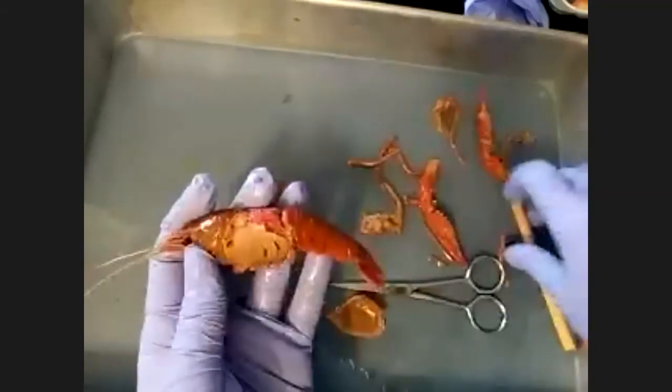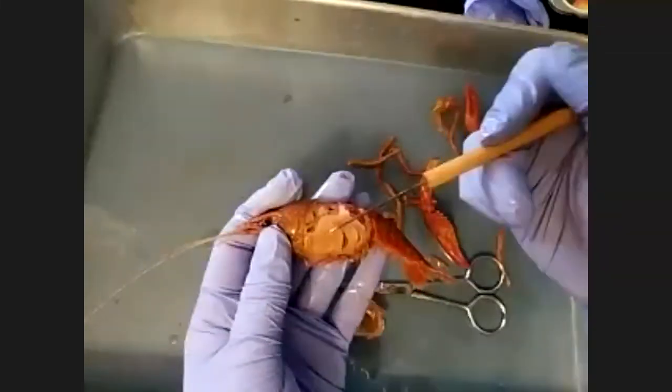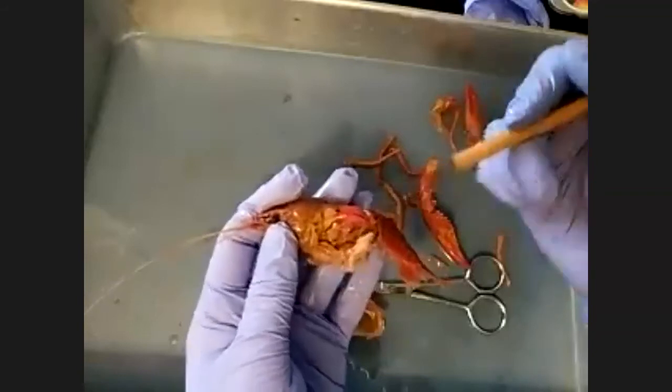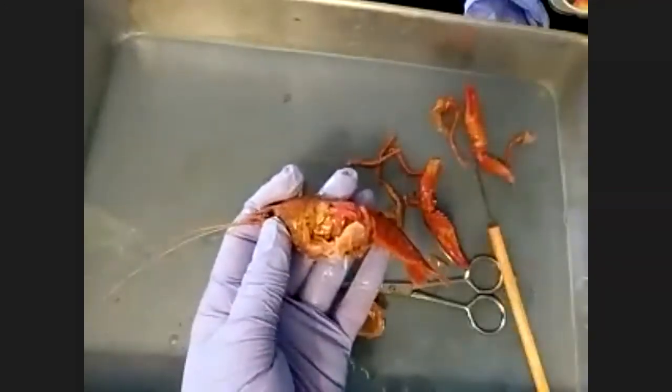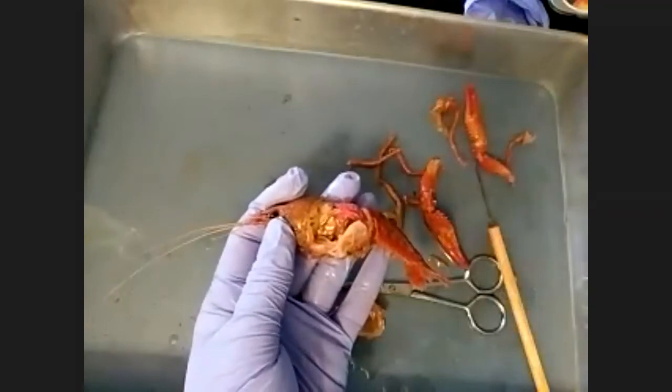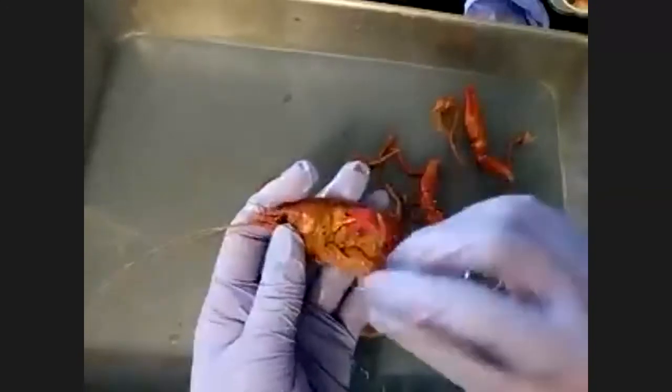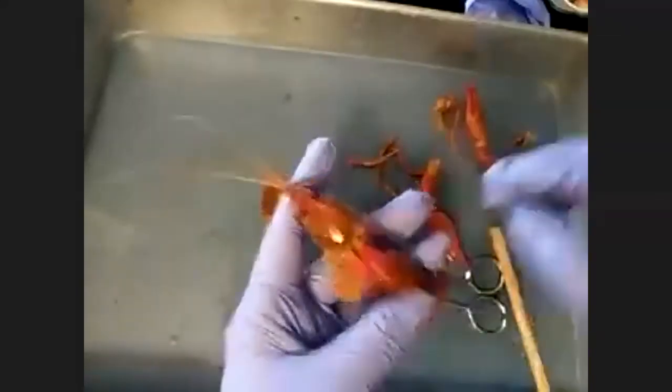Okay, so again, another set of gills, nice, beautiful, feathery. They actually use their legs when they swim. They move their legs around to move water around and into their gills. I was gonna say lungs. They do not have lungs.